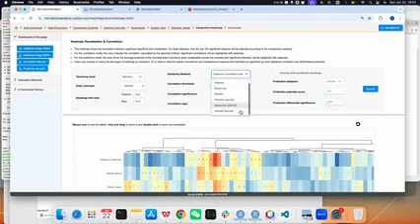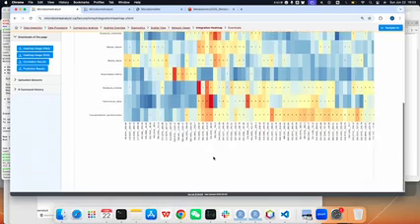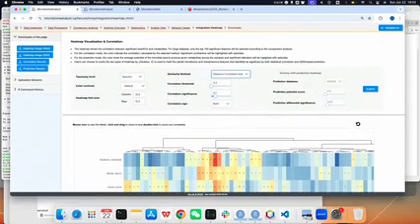We have partial correlation, distance correlation. You can explore, and if you don't have too many samples, you may use the partial Spearman correlation, which is more stable for small samples and removes the effect of other factors. You can also change the color palette and change the threshold.